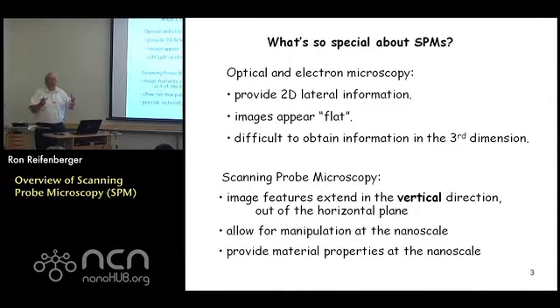Right? How do you do that experimentally? How do you move things at the nanoscale, one with respect to another? You can't just pick up a pair of tweezers and move them with tweezers, right? The scanning probe microscope allows you for this nanomanipulation capability. So this is really a unique feature of the microscope.